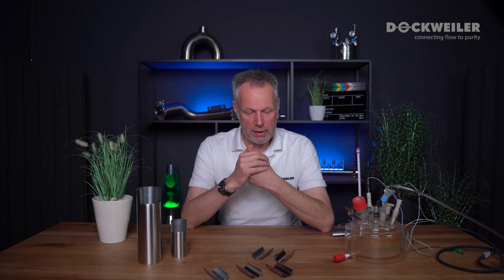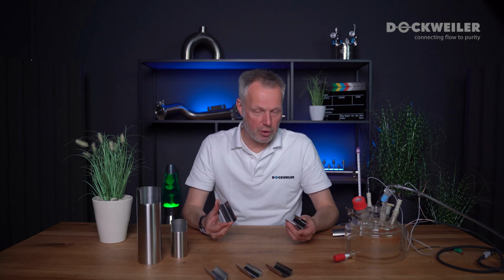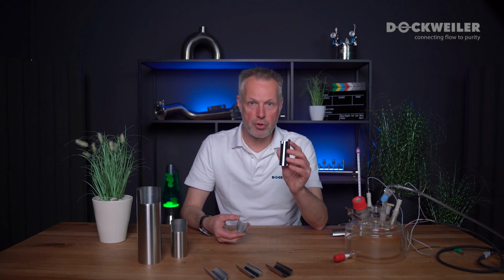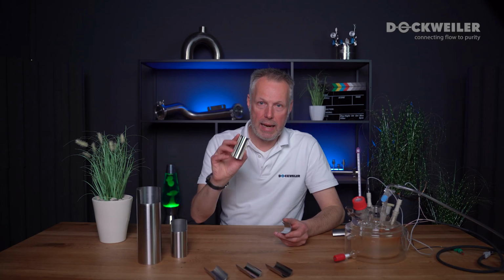So what we want to do here is have a quantitative comparison between the electropolished surface that we did during this series and the non-treated version. So the one as it was delivered and the optimized one. Because we don't know, is there a difference and how big is the difference?